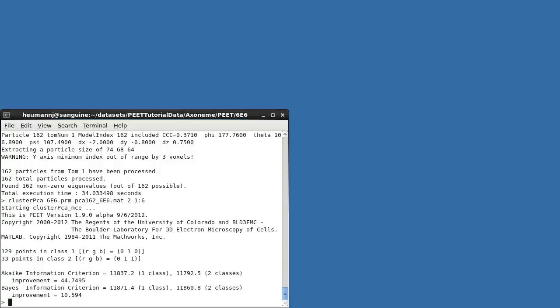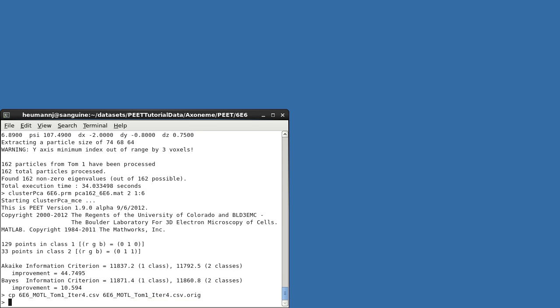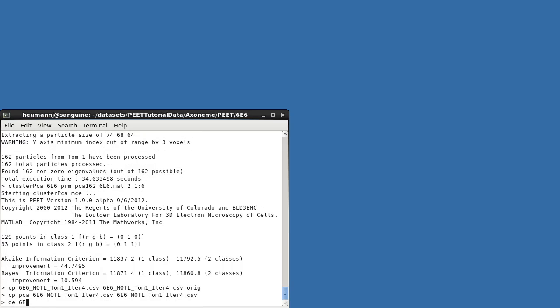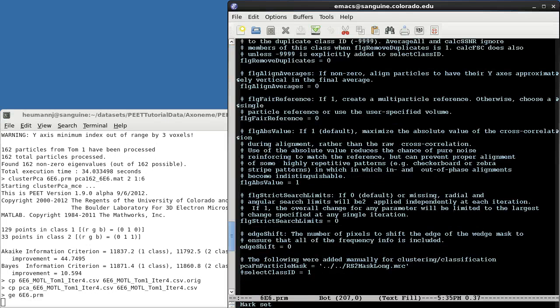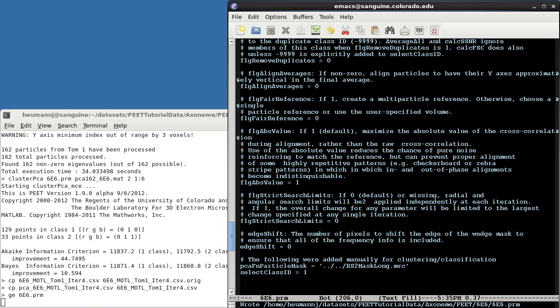To do so, we'll need the class information saved in the PCA star modal file. We don't want to lose the original motive list though, so I'll make a backup of the original, and then copy the new one into its place. Next, I'll edit the parameter file, and insert, or in this case uncomment, a select class ID parameter, saying that I only want to see results from Class 1.